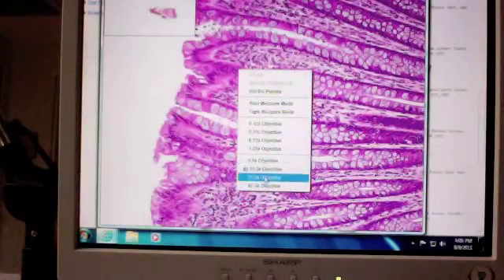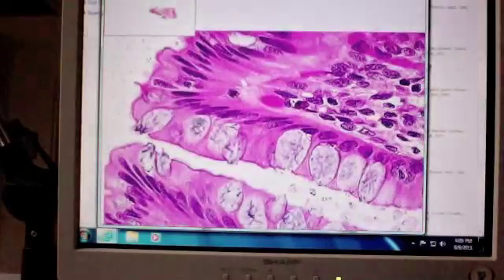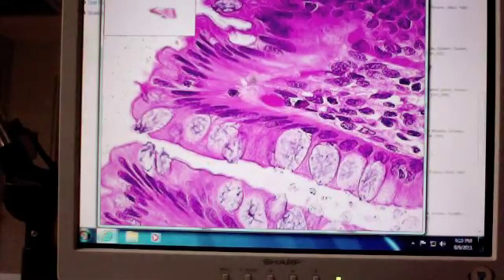And even if we're in this gland, let's just go and look at the surface again so you can just see how these look different in different sections. So from here to the surface, name this epithelium: simple columnar epithelium. Okay? So you can see again, long, skinny epithelium. Would you also call it ciliated? Not ciliated. These are actually microvilli that you see up on the border here. All right, because this is part of your gastrointestinal tract. This is in your colon. No cilia here. What about on the inside of the tubular gland?